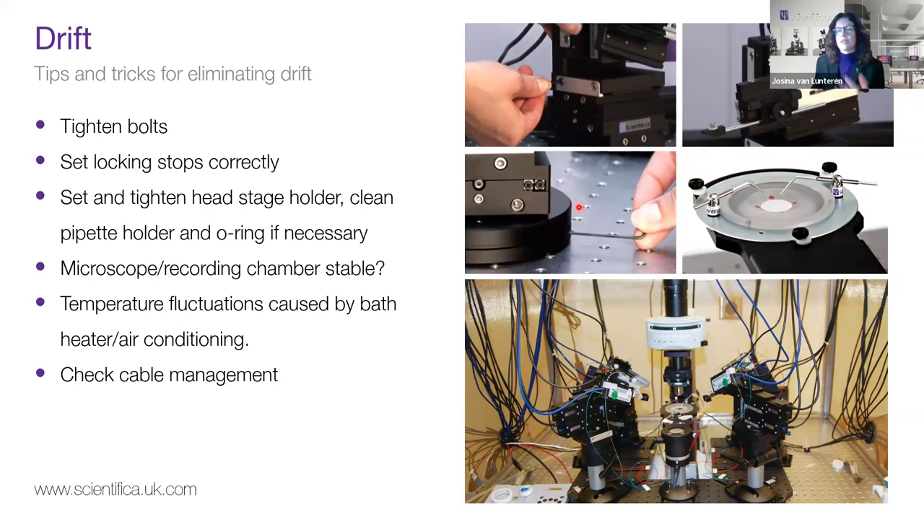On the headstage, check the pipette holder. It's a small plastic device sealed by two O-rings — check if these are tight, maybe they need replacing or the whole thing needs cleaning — and make sure it holds the pipette firmly and is tightened properly every time you change the pipette. Another thing that can shift is the microscope or recording chamber: check all the bolts there too to make sure everything is stably mounted.